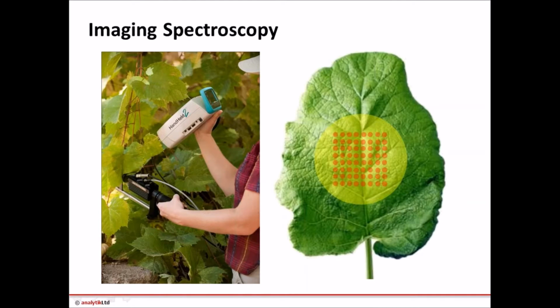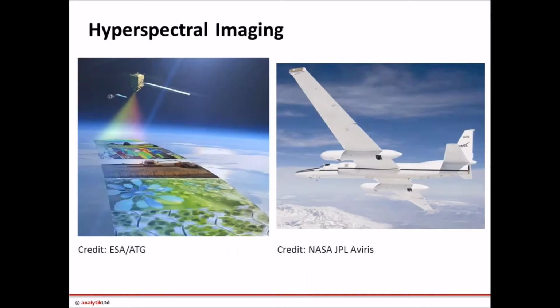The idea with imaging spectroscopy or hyperspectral imaging is that we're taking many data points over the area. So here we can imagine we've used the ASD handheld to take an 8x8 picture, 8 pixels wide and 8 pixels deep, with a spectrum behind each pixel. The only drawback is it would be really tedious and slow to do. Luckily we can do it with specialist hardware.